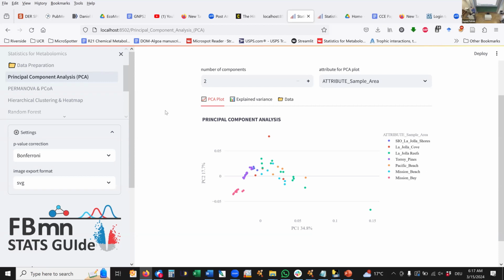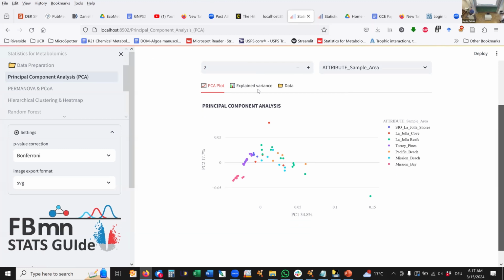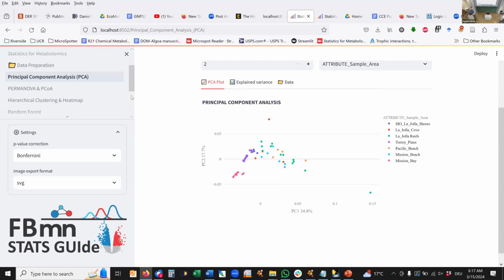So to be fair, we were really comparing very different things. So it's not too surprising that we would pick that up with PCA. But just as a first sanity check, I think this is a good way to do it. But then, yeah, Apsa showed you some supervised methods in form of the random forest, right?